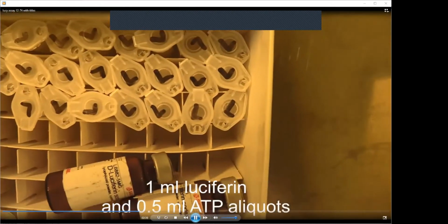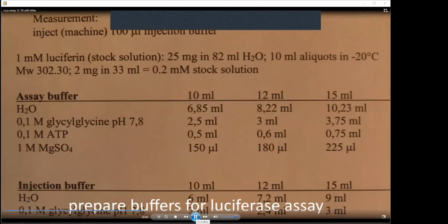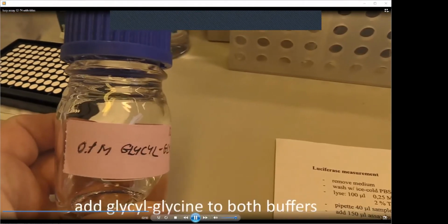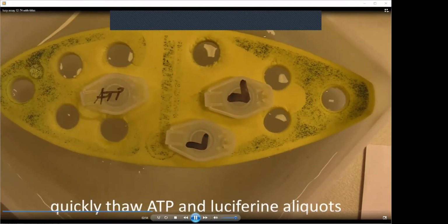ATP would be degraded in any case. So these are the aliquots, and then two buffers have to be prepared for this reaction. This is the assay and injection buffer using water, glycylglycine, that you have everything in the protocol.